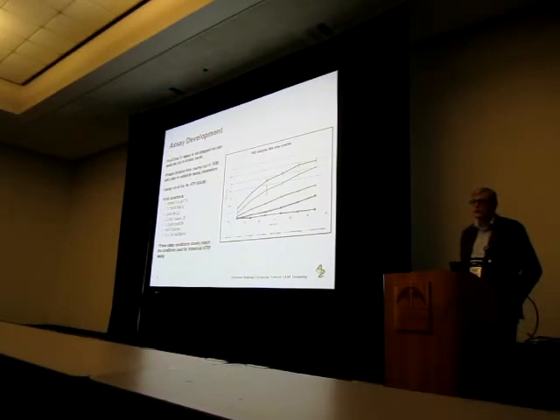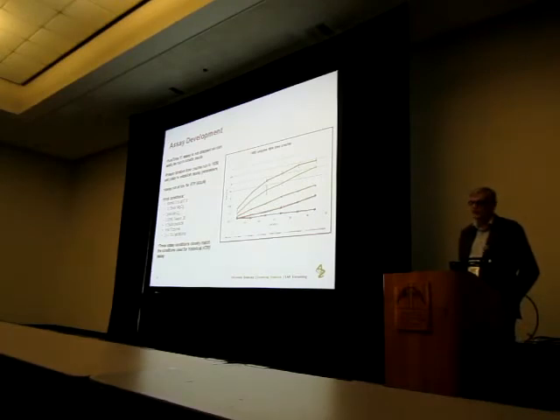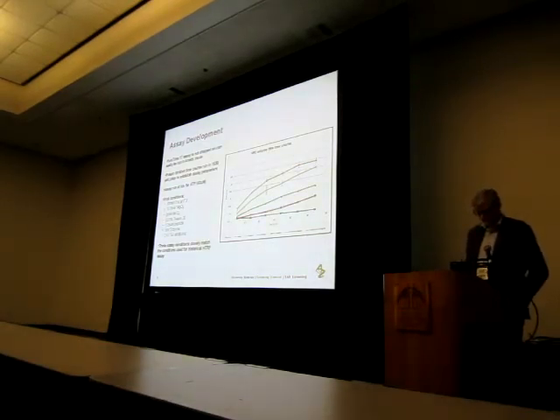Because of that, we knew that the Km for ATP was around 40 micromolar, so we didn't have to run those sorts of assays in order to do this assay development. Then we worked through the final assay conditions that we were going to need. We wanted to make two reagent additions, so there are two 1.5 microliter reagent additions. One reagent has the enzyme in, one has the substrate in, so it's a fairly simple assay to automate from that perspective.